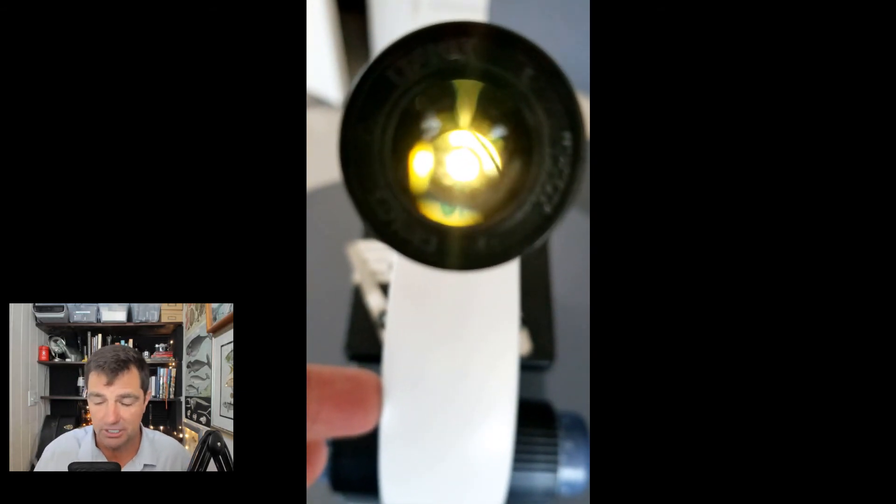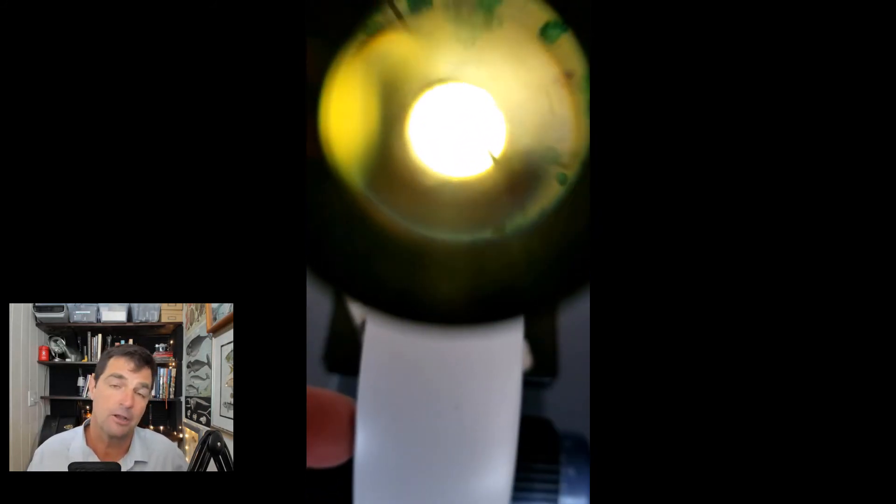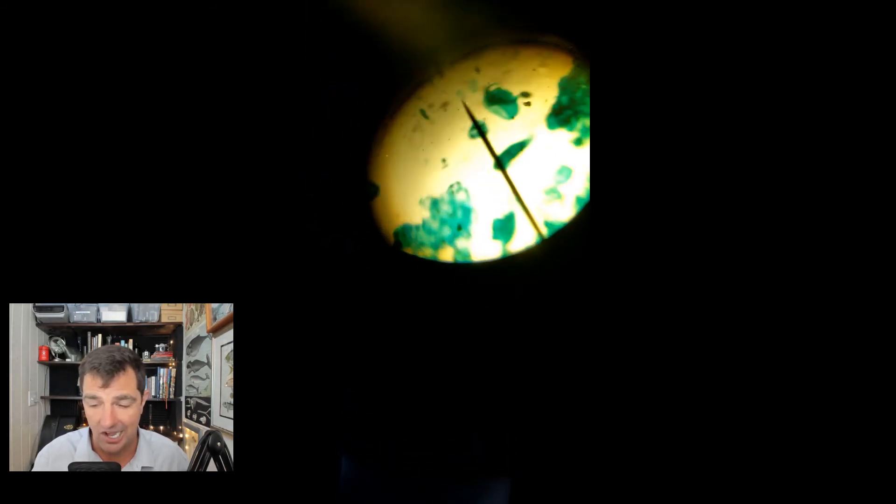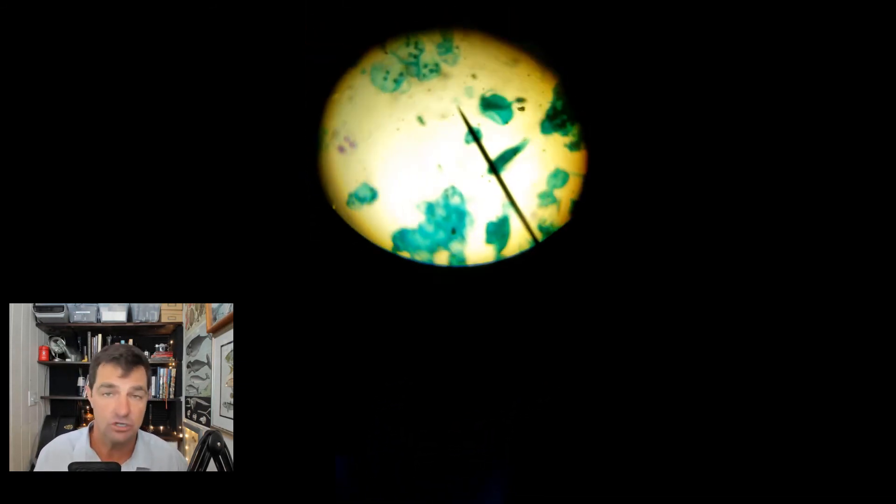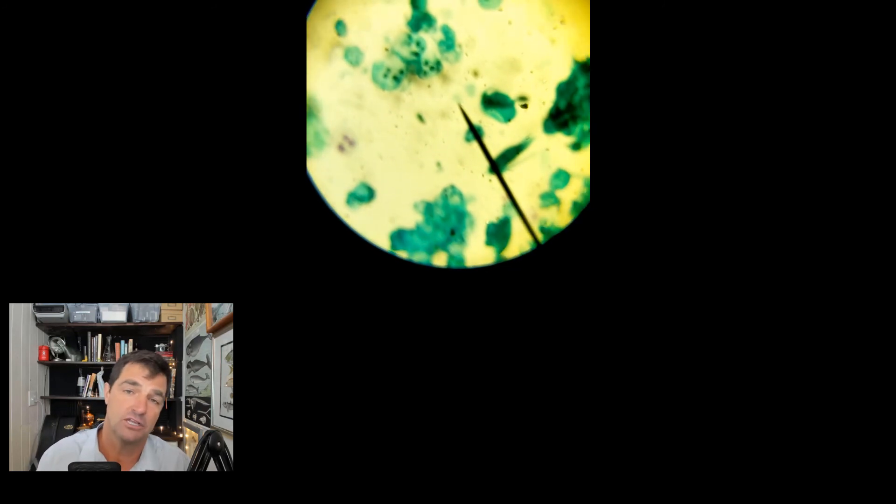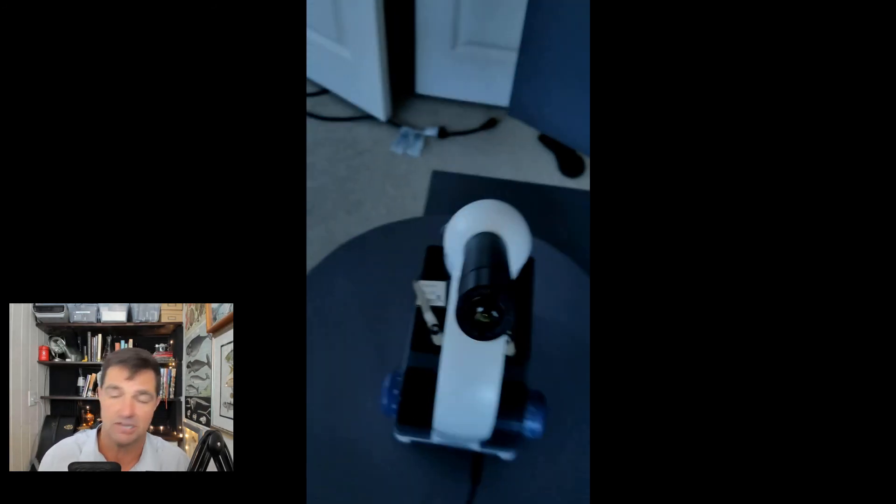Then you simply follow the light in as you move the camera closer to the microscope. If you follow that light circle and keep it in view, it will focus what you see in the microscope, and you can take a video or picture like you're seeing here.